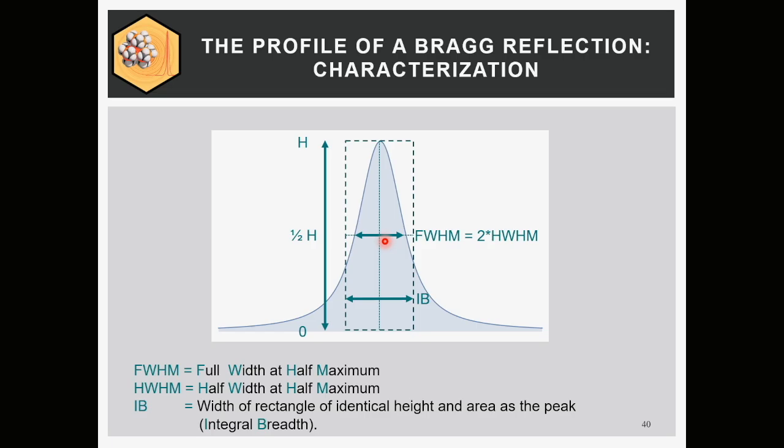When we look at a peak, we have to characterize it. What are the typical things to characterize a peak? You want to actually know how broad the peak is. It's a very dangerous thing, because you have to subtract lots of apparatus effects if you really want to learn something from the width of the peak. So again, the instrument must be deconvoluted.